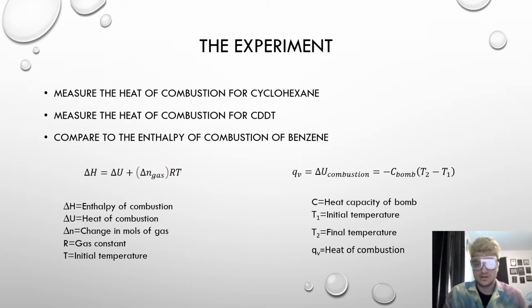So the basics of the experiment that we're going to set up is we're going to measure the heat of combustion for cyclohexane and the heat of combustion for CDDT, and compare that to find the enthalpy of combustion of benzene as well as its resonance energy.